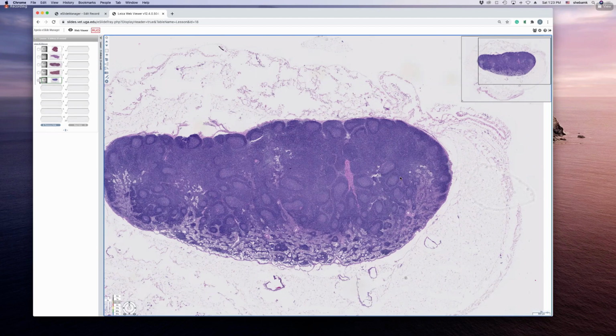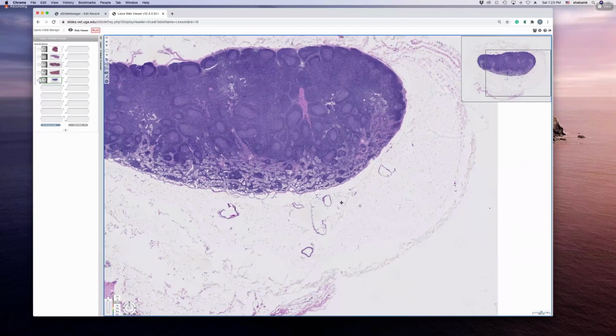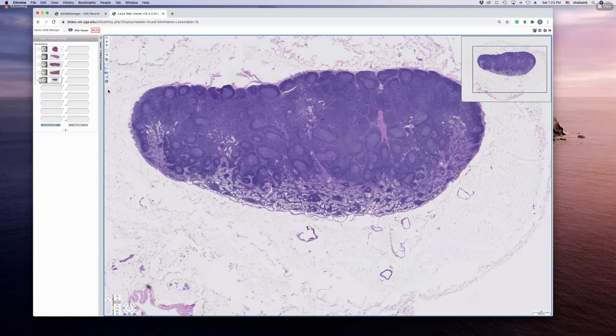Okay, if it was a primary lymphatic nodule, it would be quiet and dark, like maybe this one. Maybe we are cutting the edge of the lymphatic nodule here, but if it was not activated, this is how it would look. Okay. So that is it for this lymph node.